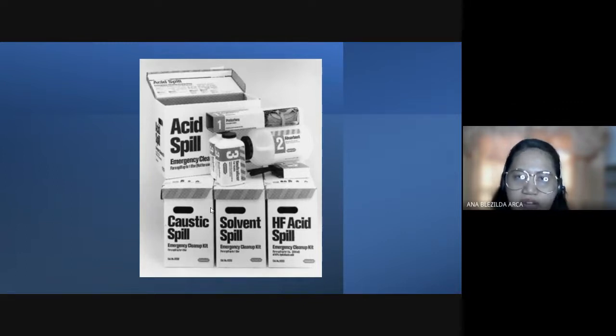Kasi class, kapag nagkaroon ng spillage sa laboratory, ano bang gagawin mo? Let's say may natapon na acid. What are you going to do? 'Di ba? Basta ka lang ba kukuha na lang ng basahan dyan? Uy, kuha tayo ng basahan. Kuha tayo ng tissue, di ba? Punas natin sa acid. Mali, hindi class, hindi ganon. Kasi class, kapag chemical spill, you should neutralize first the chemical. Okay, neutralize mo muna yan. Kaya meron tayong mga spill kit eh. May mga binubuhos dyan na mga chemical din to neutralize them before you wipe it clean, di ba? Bago mo siya punasan. Okay?